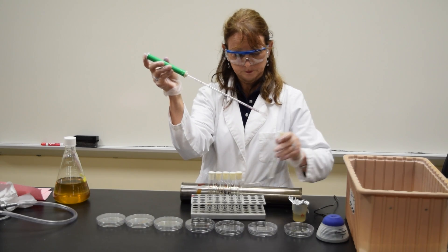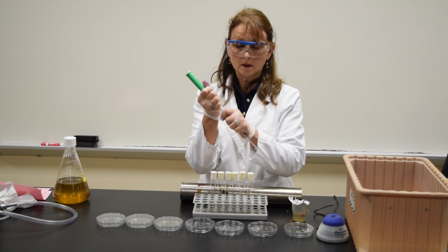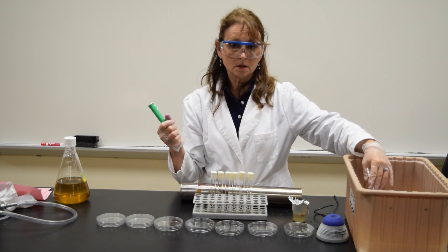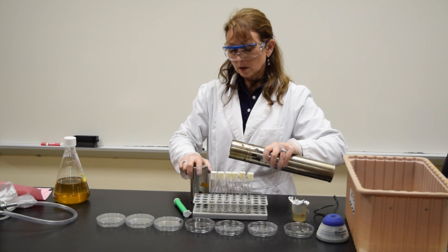I'm going to vortex the tube. At this point, I'd like to change the pipette. Remove the pipette, place it in the dishpan with the bleach. Get a new pipette.